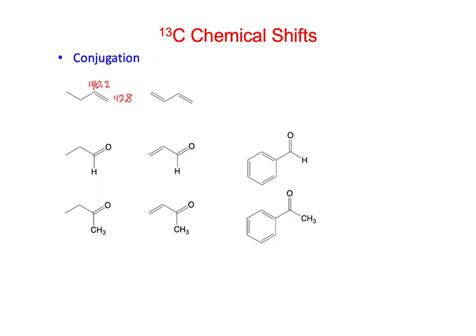But if we have, instead of one double bond, a conjugated system, then this one goes downfield, and this one is actually a little bit upfield. I think what happens here is that you can just show various resonance forms of this. You could move these electrons over this way, though that wouldn't really give that one. But they move around a little bit, so it causes some changes.